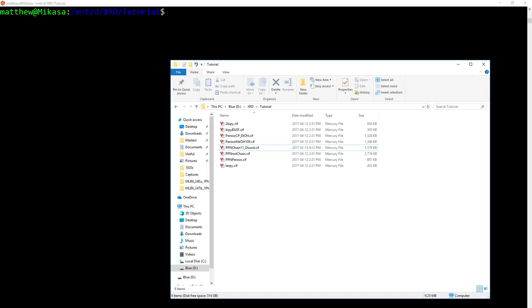The first thing to note is I've included the complete authorship information in every one of the CIFs. That makes it very easy to stick them together in an arbitrary order and have everything just work. That's totally acceptable by the CIF standard and it means you don't have to worry if you decide to remove one from the paper or add another one. Each one is effectively an independent file even if you've stuck them all into one master file.